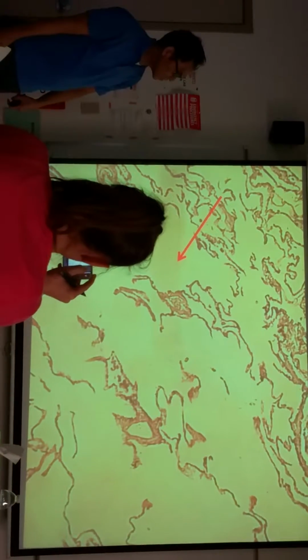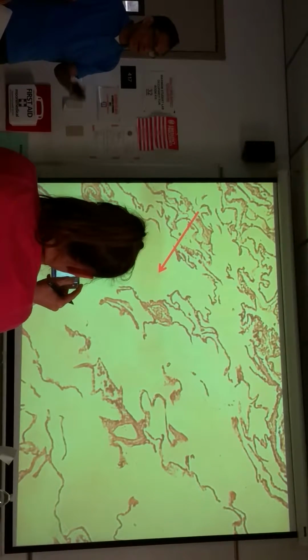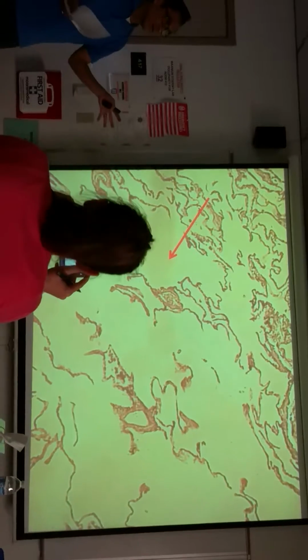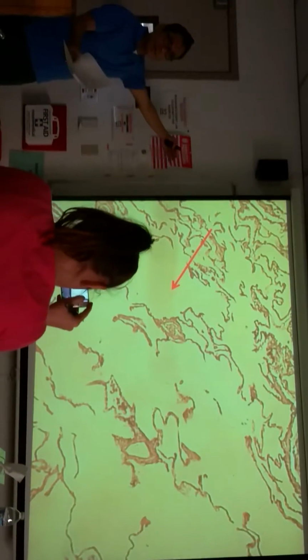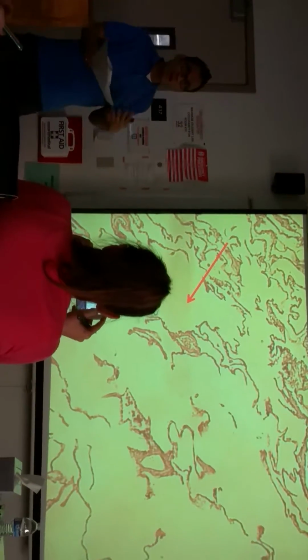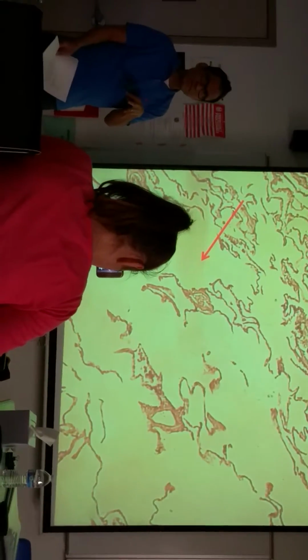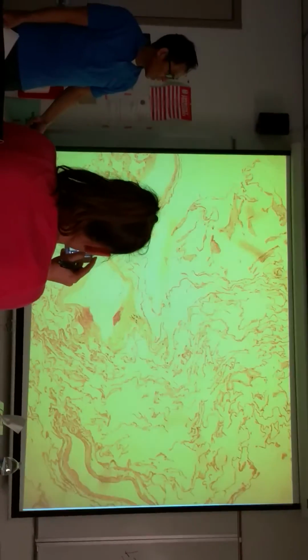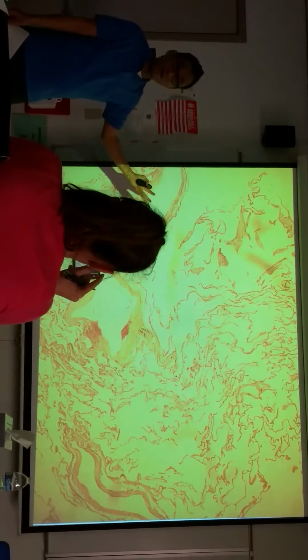On closer magnification, what we say is you have fewer, larger alveoli, and I'm pointing to one. The reason you have large alveoli is because all the walls are breaking down. It's like if I knock this wall down, now we're one continuous room with the lab behind it. In gas exchange, a larger alveolus is not as efficient because it's hard to exchange across a larger space. Larger is not better. So this is a larger alveolus. I'll just say, what condition is this? And you say emphysema. Okay, this is the lung, and that's it.